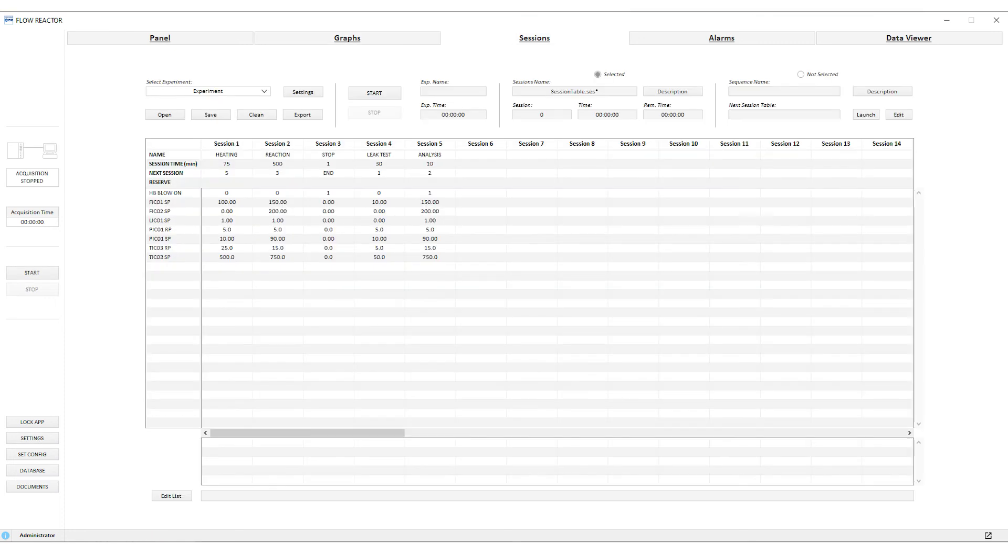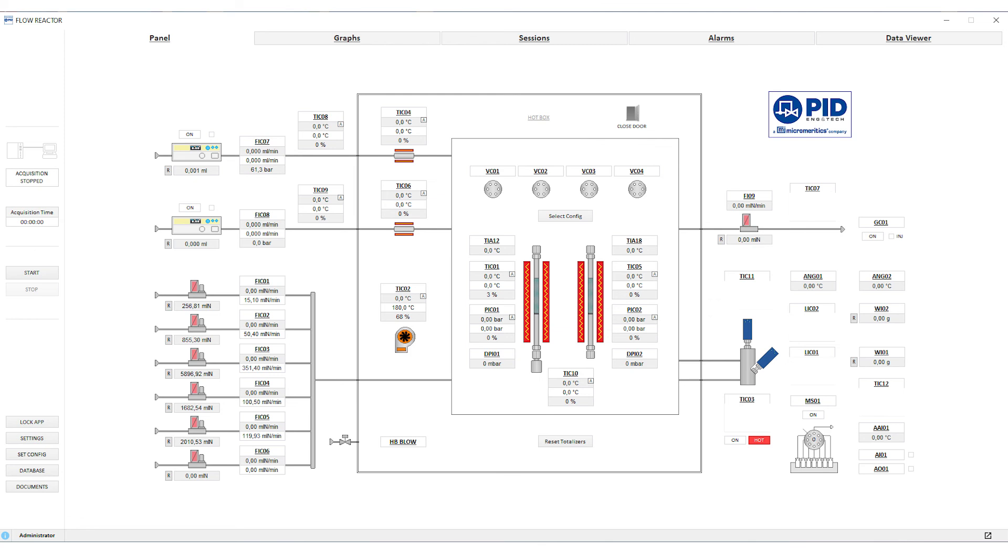The FR is a fully integrated and automated platform. Custom procedures including heating, cooling, and catalyst regeneration sequences can be created for unattended operation.